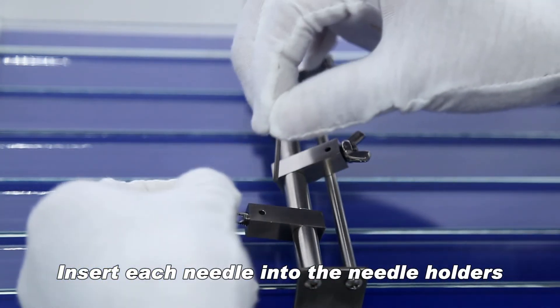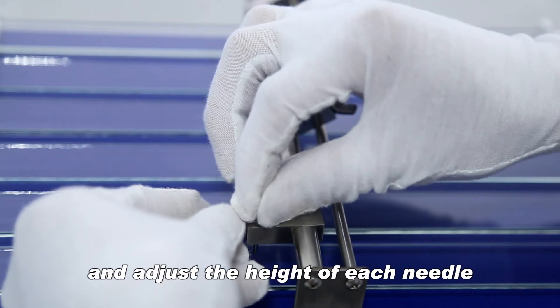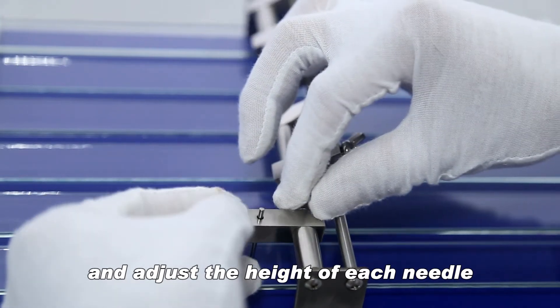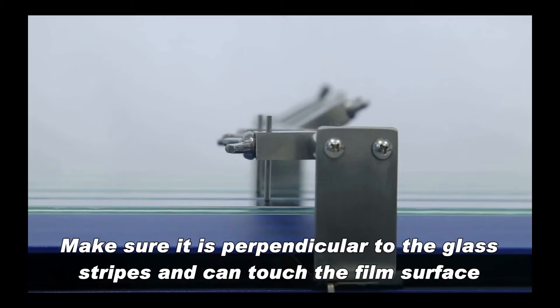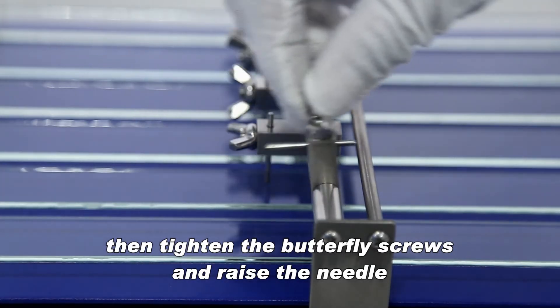Insert each needle into the needle holders and adjust the height of each needle. Tighten the screw, make sure it is perpendicular to the glass stripes and can touch the film surface. Then tighten the butterfly screws and raise the needle.